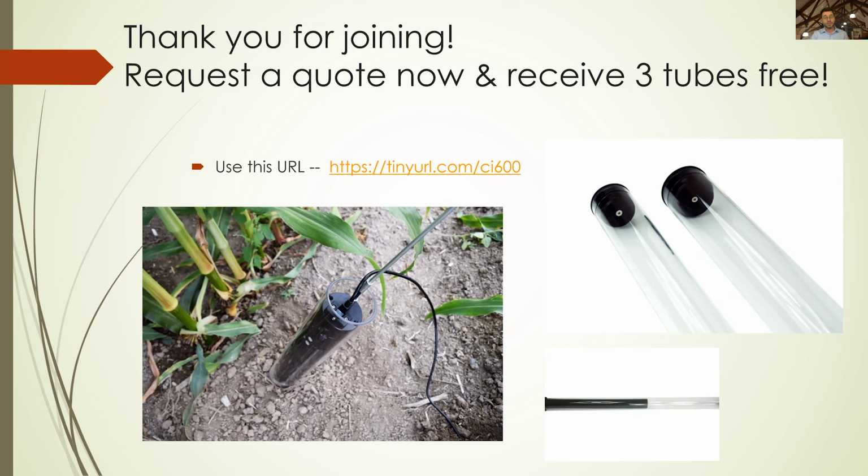The next question is, can we still have the option of WinRHIZOTRON software besides the RootSnap? And the answer is yes. Actually, these scans are all being saved in a couple different methods, both with the data alongside as well as just a simple image. You can take the simple image and put it in WinRHIZOTRON or any other software you'd like.